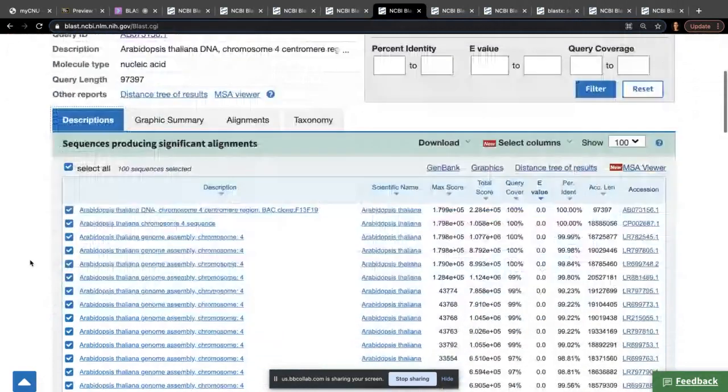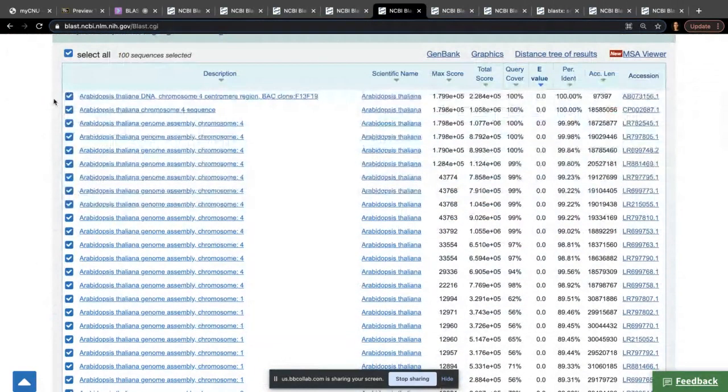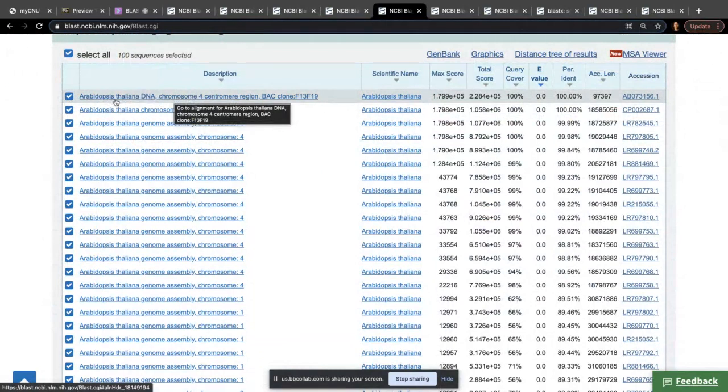And then I look here and I go, oh, okay, really no such luck. So this is just saying which organism the sequence is from. Okay, maybe I got the sequence from that, so I already knew that part.